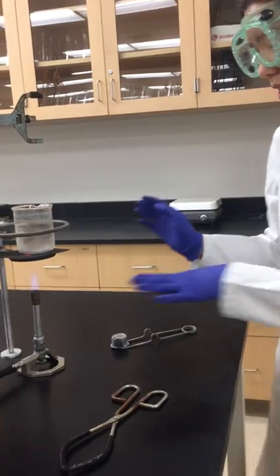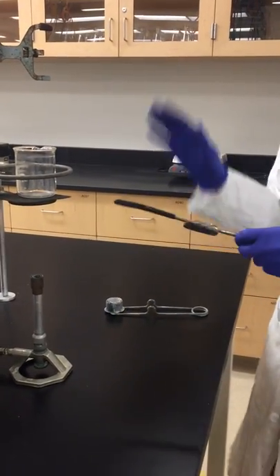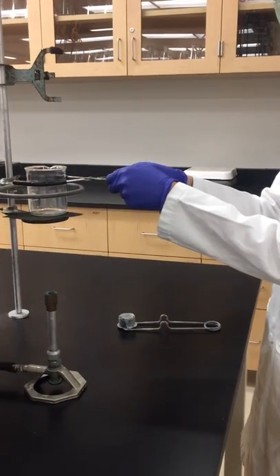Once we're done heating the substance, we remove the Bunsen burner from underneath and turn off the gas supply valve. And using the beaker tongs, because the area is hot, pick up the beaker.